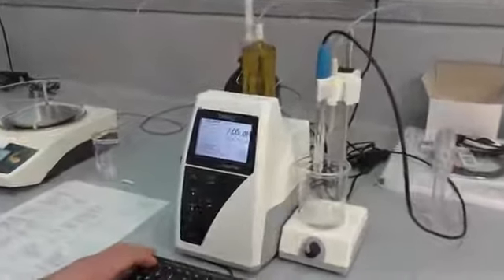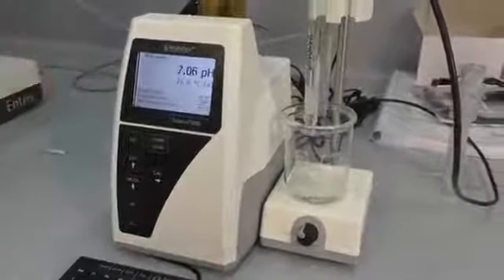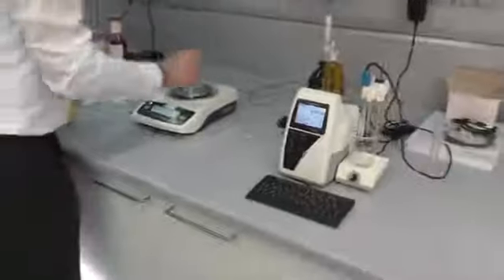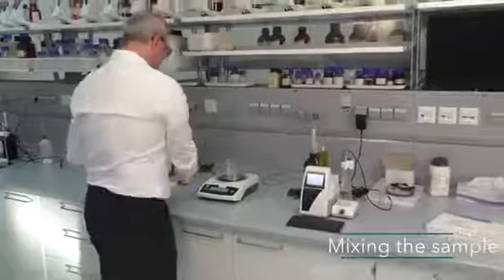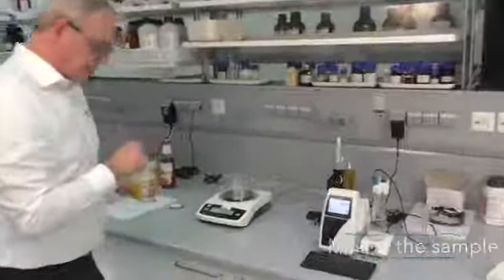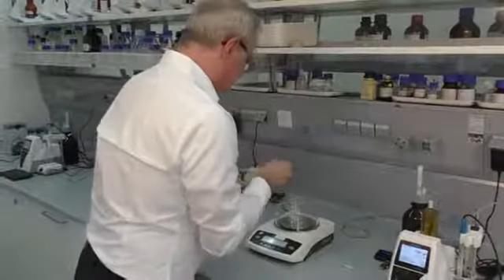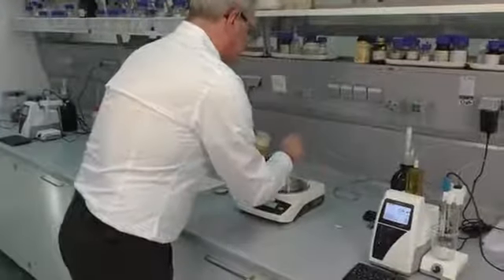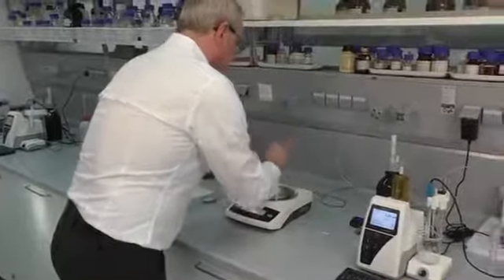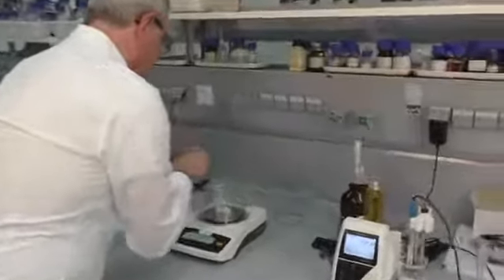So now we have a method called acidity in mayonnaise. We use a beaker, place it on a balance, press Tara. We mixed the sample a little bit before, and we will now use three or 4 grams.